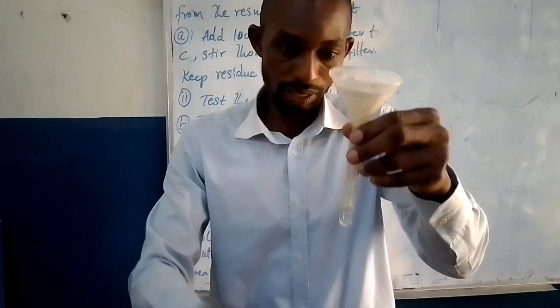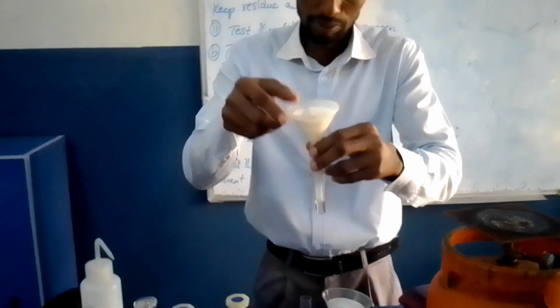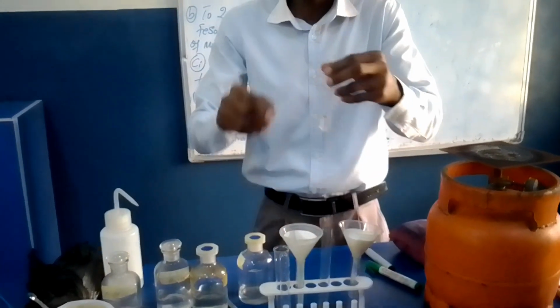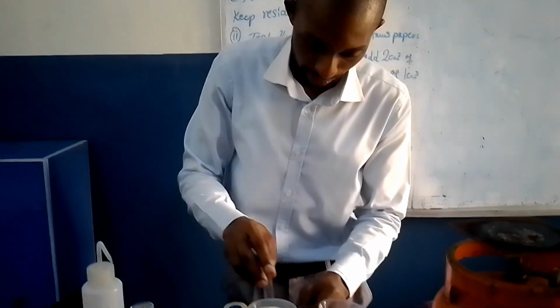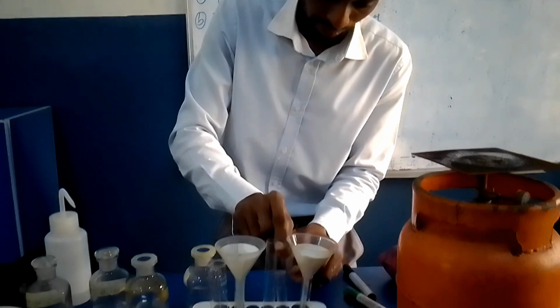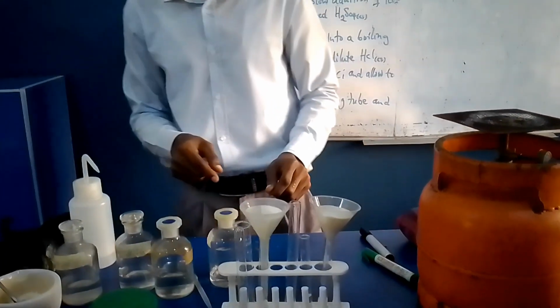Now because I've gotten enough, I can transfer this into this test tube. The one I have is enough for the next practical. I can keep this to avoid wasting my time, and then use it to carry out my experiment. So let's go to the next stage of the experiment.